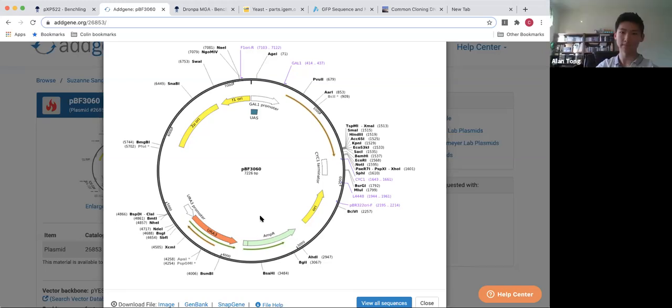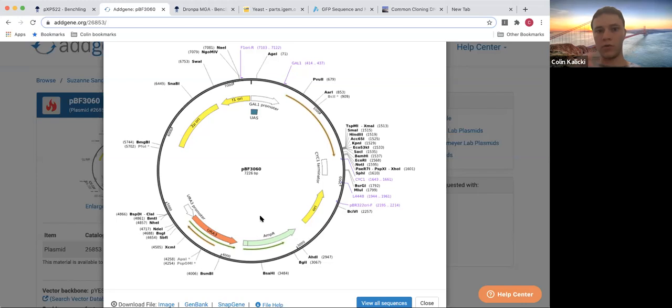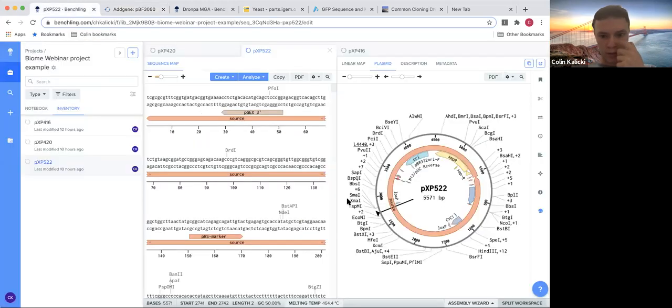And so in this case, yeast normally can produce everything. They can live on their own. However, we have engineered strains that won't produce certain amino acids for themselves. So you'll have a leucine that's knocked out. You have a histidine. And so we engineer these yeast so they are auxotrophic. In real life, they're usually, I think prototrophic is what it's called, in which they can produce the things. And so you have this thing here. This is an example of an auxotrophic selection marker. It's not as popular. The more popular ones are usually histidine or leucine.